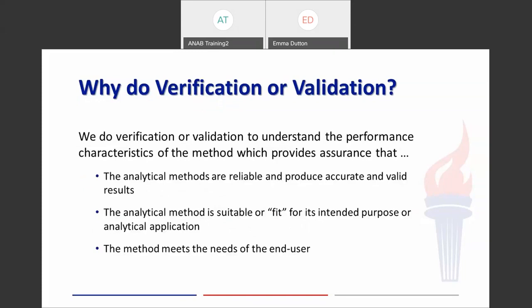So why do we do verification or validation? Really, we do it so we understand the method and we understand how the method or the procedure provides an accurate, reliable result for us. It's for us to understand those performance characteristics of that method or that procedure to give us that assurance that our analytical methods are reliable, that they produce accurate and valid results, that the method is fit for purpose or its intended use, and that the method actually meets the needs of that end user.